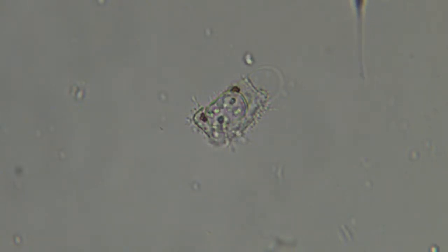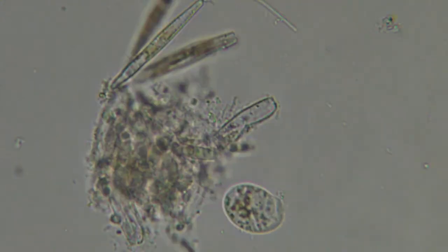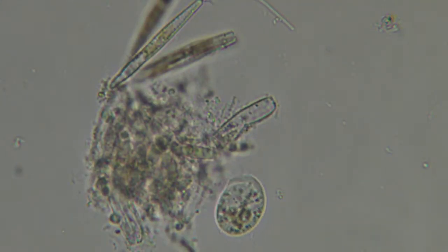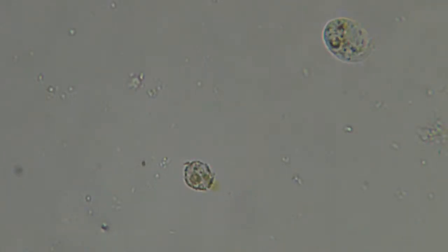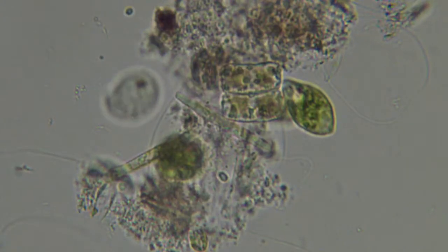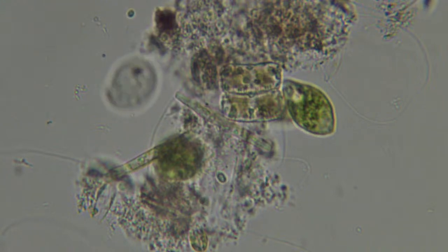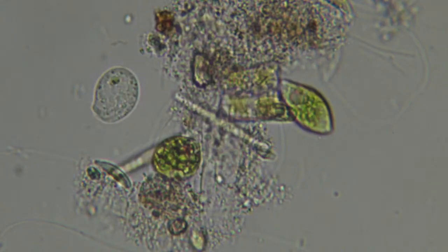There's a pointy diatom going by. Then all these little ciliates, checking this out. Little bouquet of diatoms. A lot of these guys on the slide, I have to check them out. Another little cluster. So there's some boxy diatoms there together next to Euglena, and all those little ciliates spinning around.